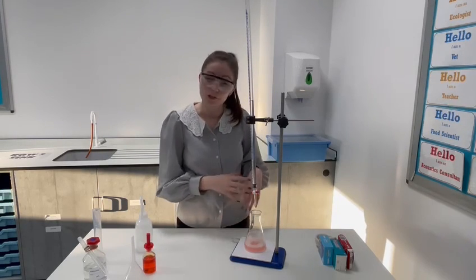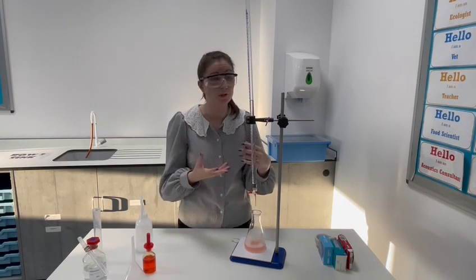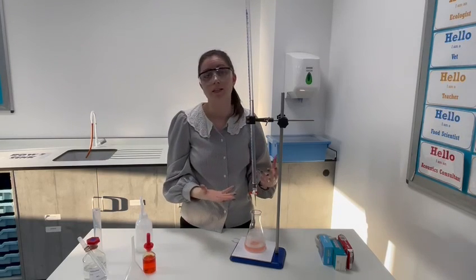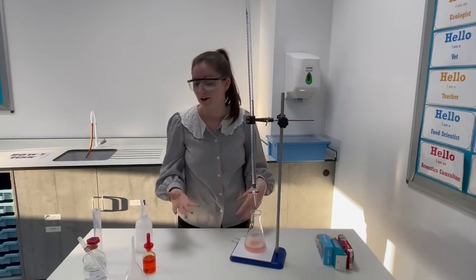So now that my indicator has changed colour, I know that students can now deduce that the volume of acid that was used is the volume of acid that that tablet was able to neutralise. So we no longer have a neutral solution because our indicator is a different colour.